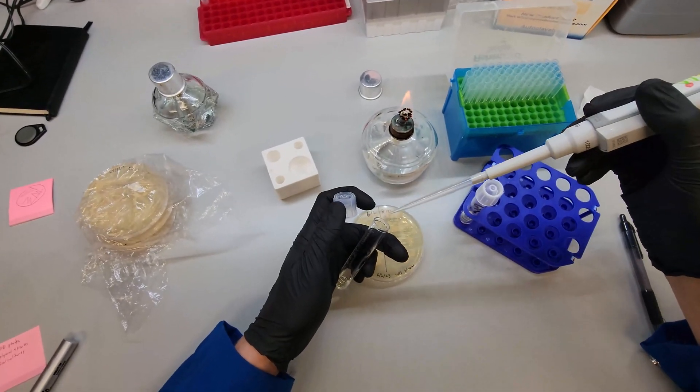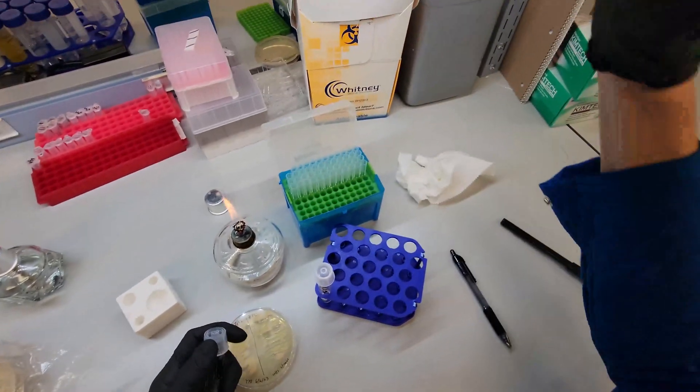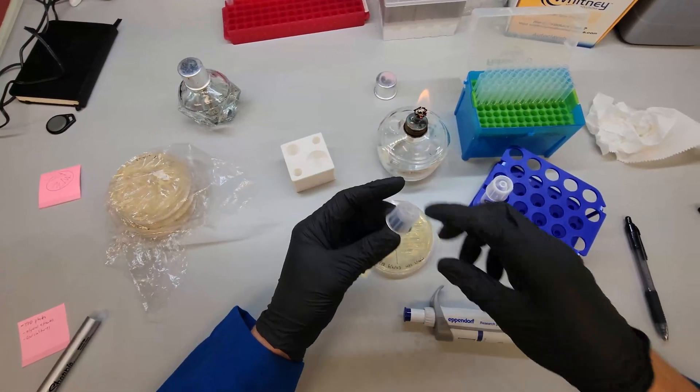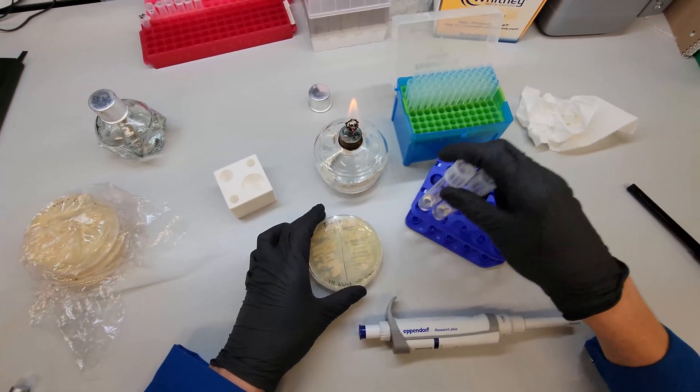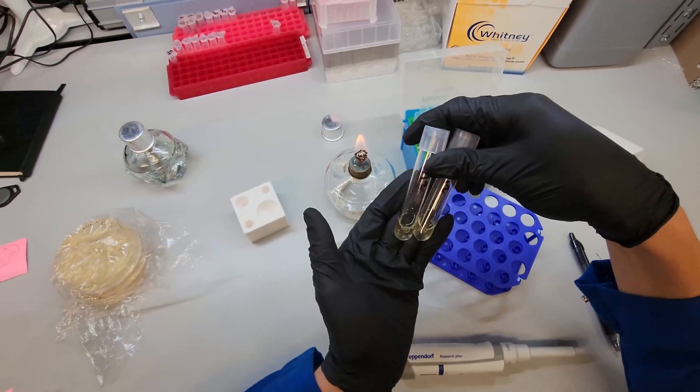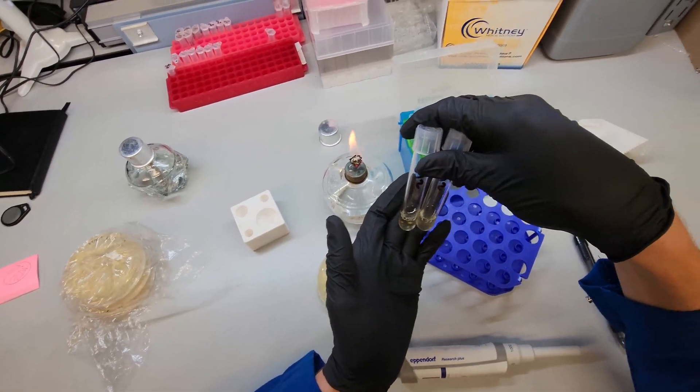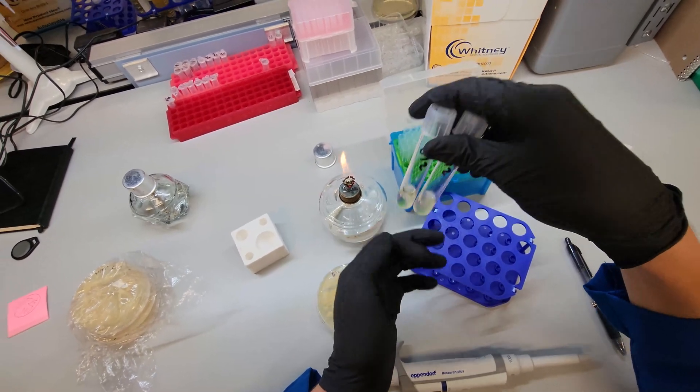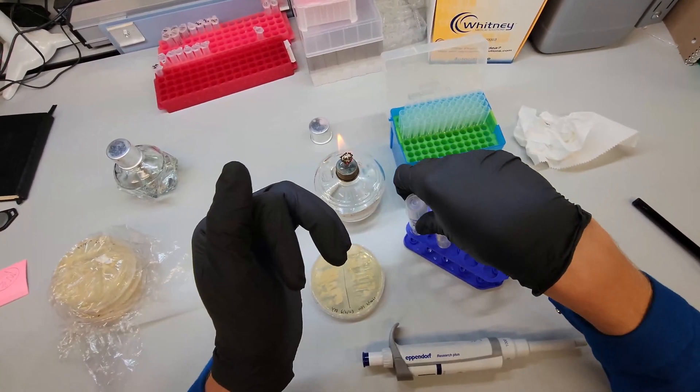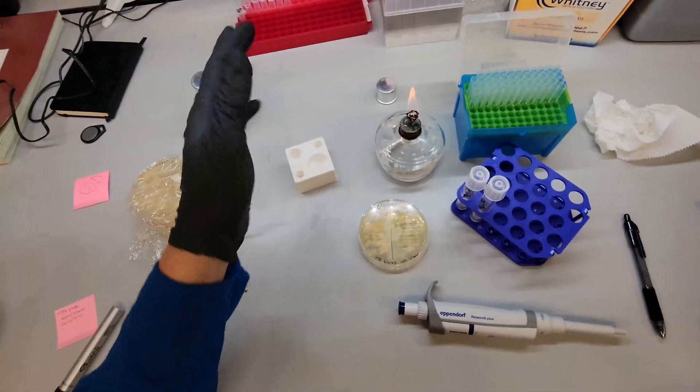Just to be safe, I like to be able to see the cells. This is probably twice as much as I would be very comfortable inoculating with. So you can see the chunk floating around in there. We definitely inoculated these culture tubes. That reduces our risk of contamination and also lets the cultures grow quicker. If you start with more cells, you end with more cells. So just some things to consider depending on what OD you want to grow your cells to.